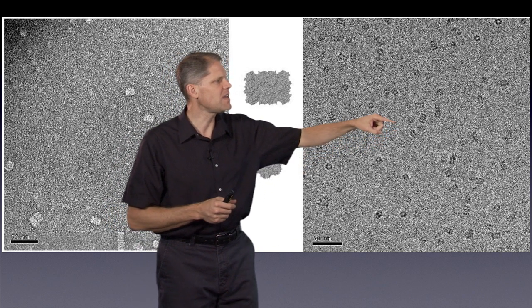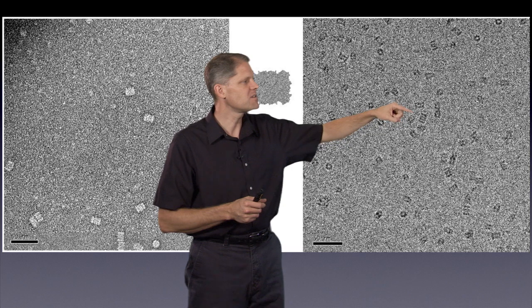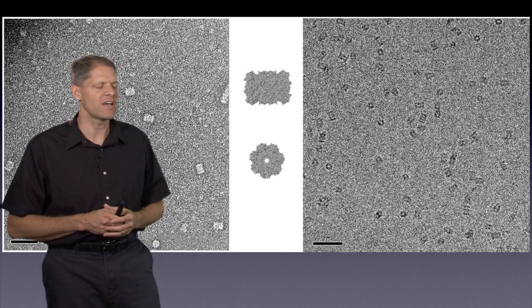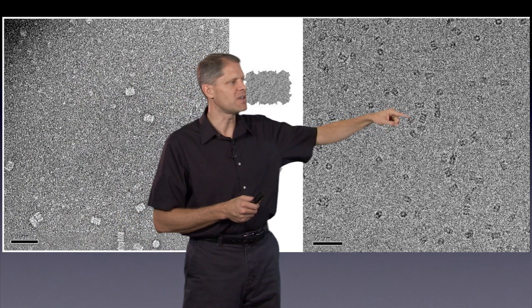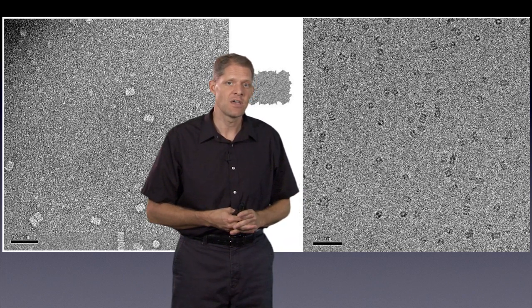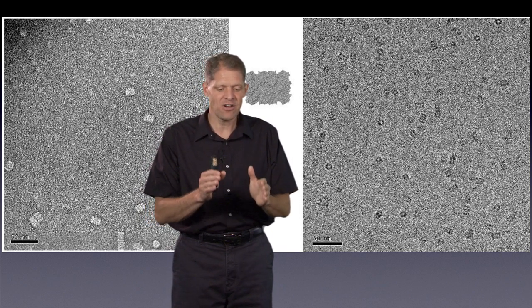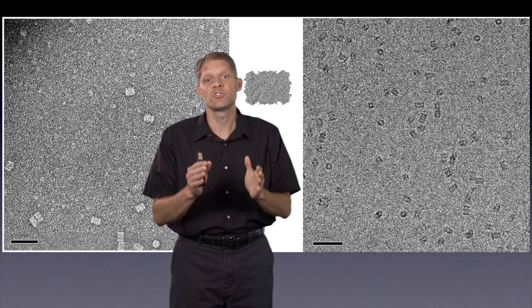And so again, you can see the details of the barrel-shaped protein being a stack of four rings. And so here's a side view, and then here, for instance, is a top view showing the view down the barrel. And you can even see there's a hole in the center of the barrel, as we know from X-ray crystallography. And so in this cryo-EM image, there is the possibility of eventually visualizing the secondary structure or even atomic structure of the proteins, because the proteins are in their native hydrated state. We still have the problem, though, that we can't resolve those details from a single protein, because the number of electrons that it would take to resolve those structures would destroy a single protein.